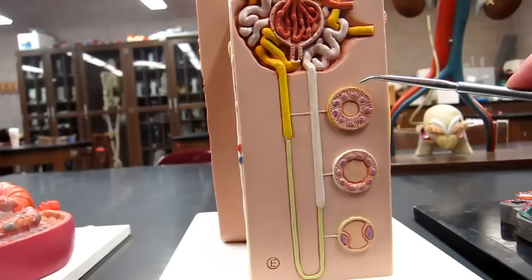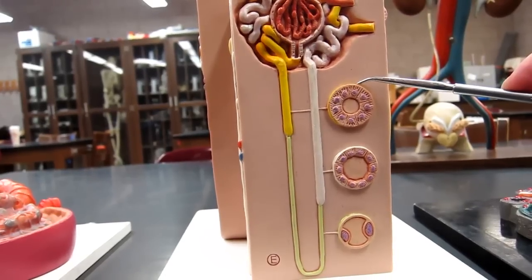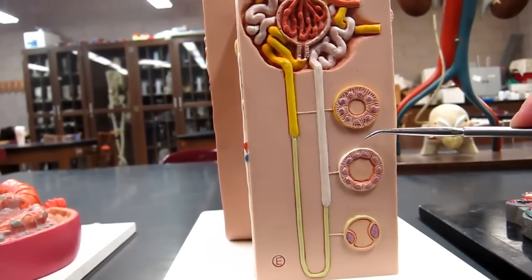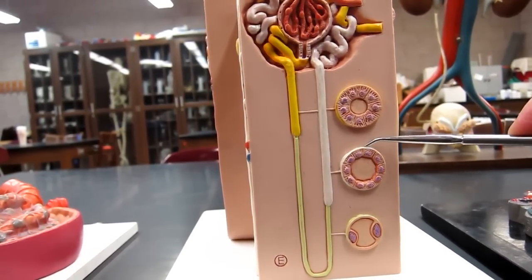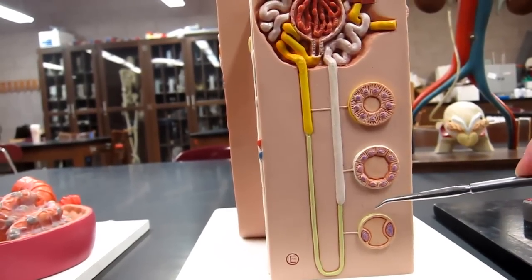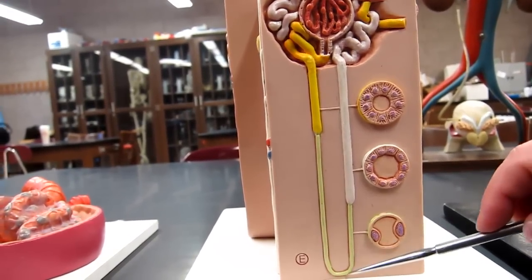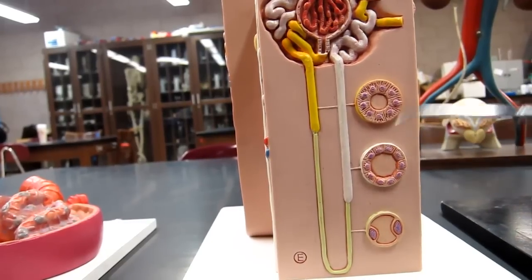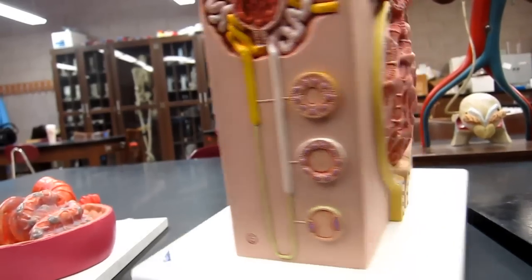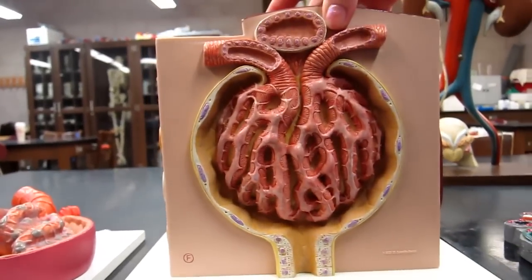So proximal convoluted tubule, simple cuboidal, lots of microvilli. Distal convoluted tubule, thick loop of Henle, simple cuboidal, few microvilli. Thin segment of the loop of Henle, simple squamous epithelium. Okay, and last but not least, one more time, turn it.